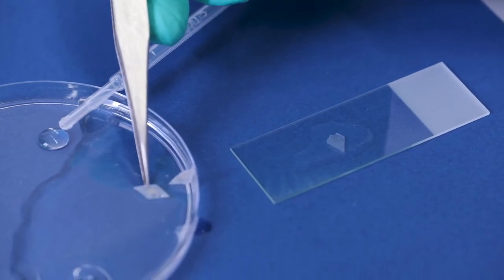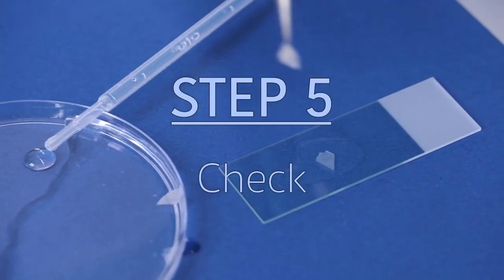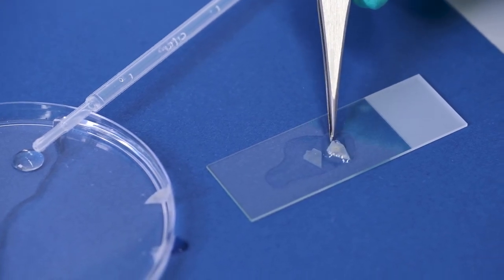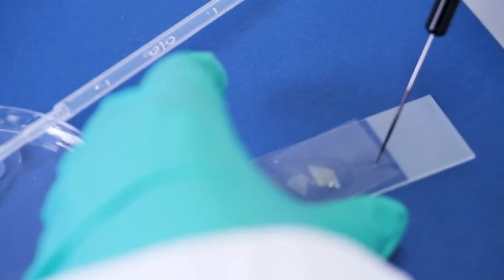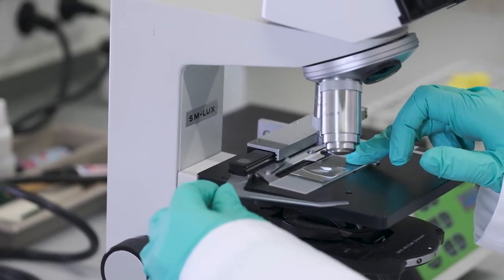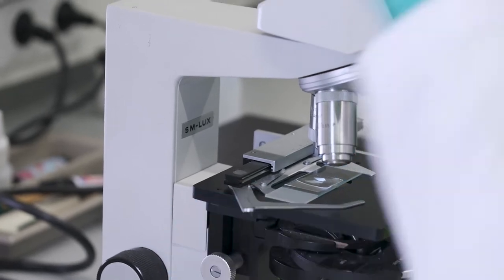You need to check if you have the right leaf side. So you put it on a glass slide, cover it with a cover, and then you check under the microscope if you have the right part that you want.